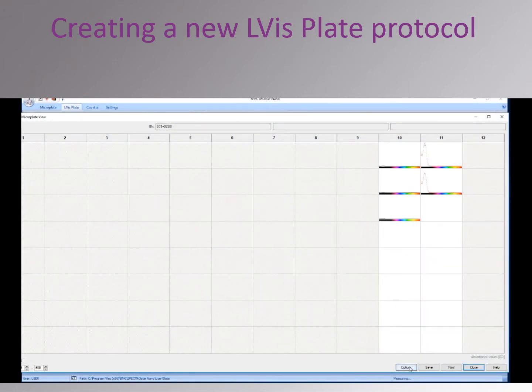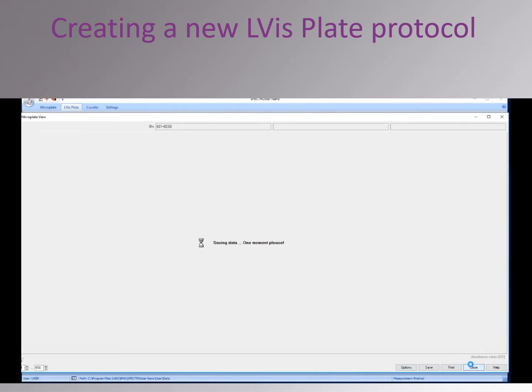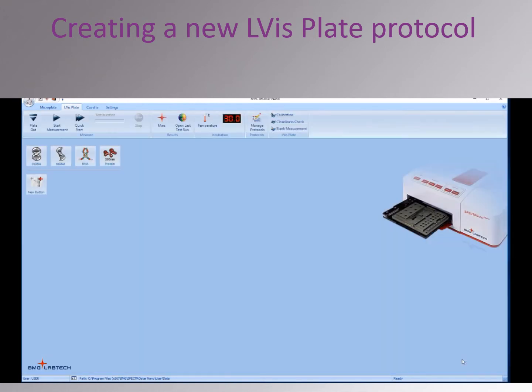If you click on the current state during this measurement, you can see the spectral data being captured in real time. Once the data collection is complete, close the current state so the data can be saved. The data can then be viewed in Mars.